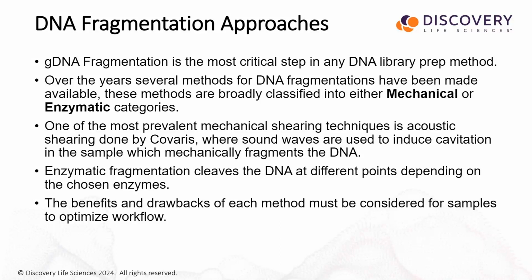Over the years, several methods have been tried, and broadly these methods are classified into either mechanical or enzymatic categories. One of the most prevalent mechanical shearing techniques is the acoustic shearing done by Covaris, where these sound waves are used to induce cavitation in samples, and it mechanically fragments the DNA.